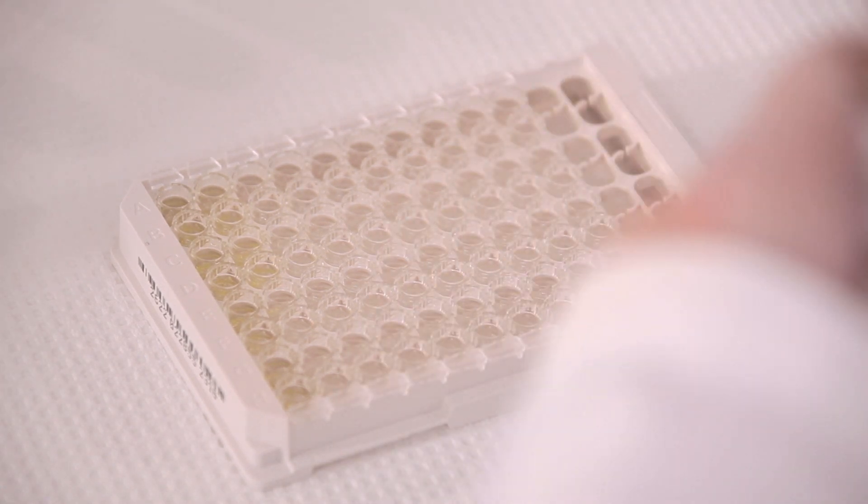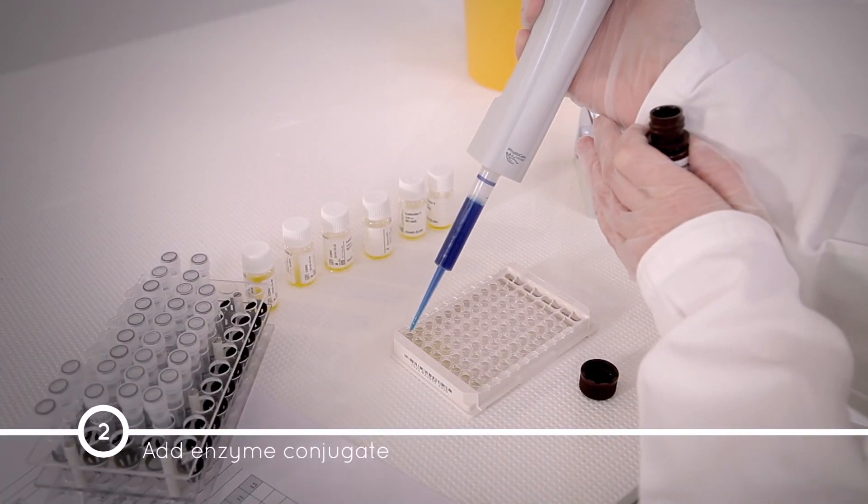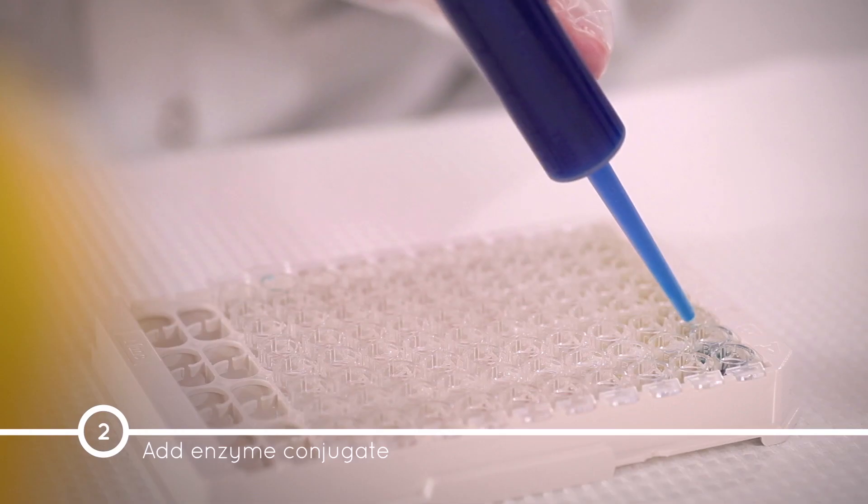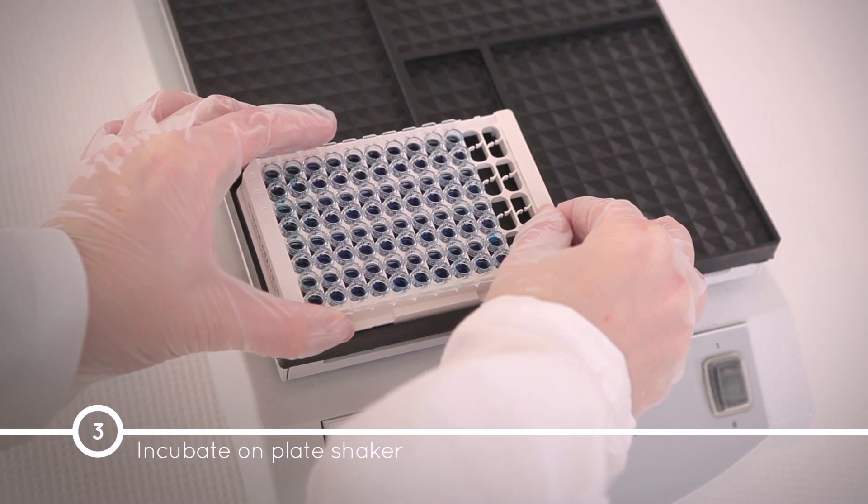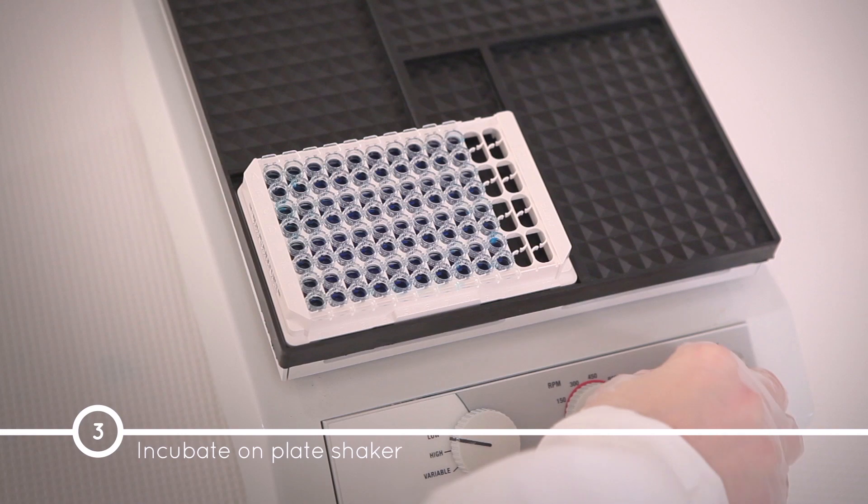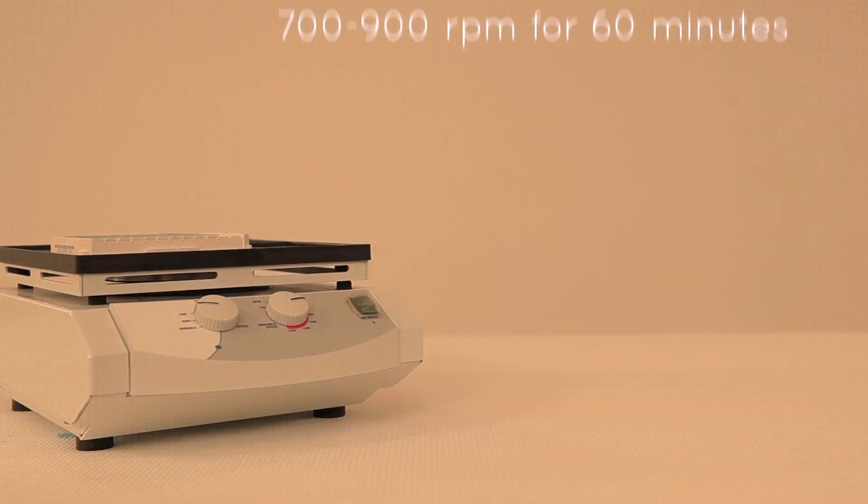The samples and controls are colorless. Now, add 100 microliters of Enzyme Conjugate 1X solution into each well and incubate on a plate shaker with orbital movement set to 700 to 900 RPMs for 60 minutes.